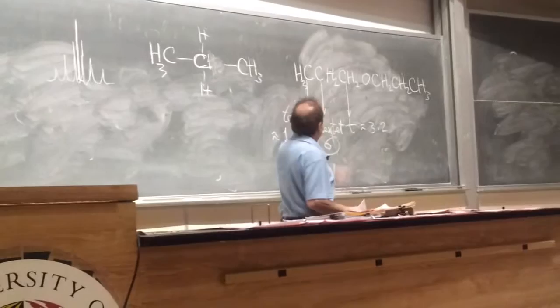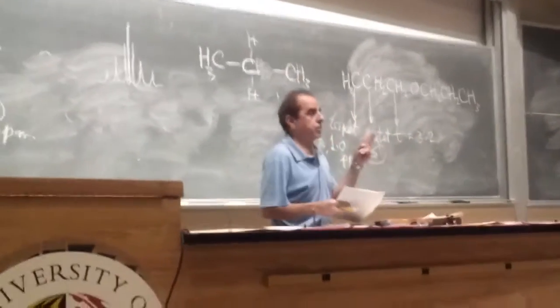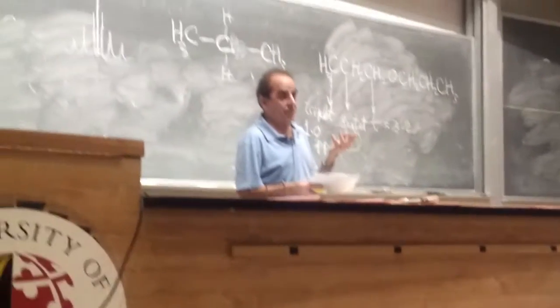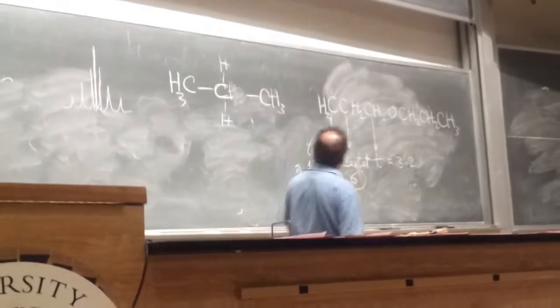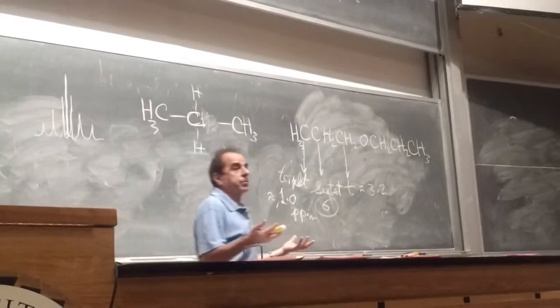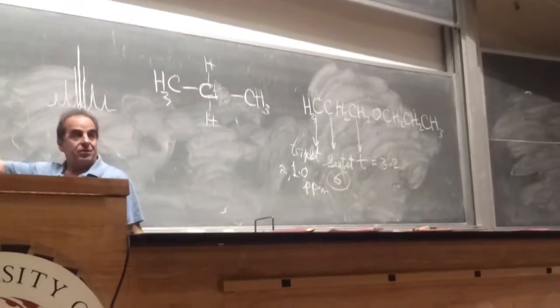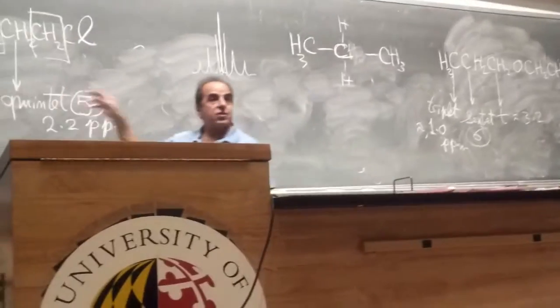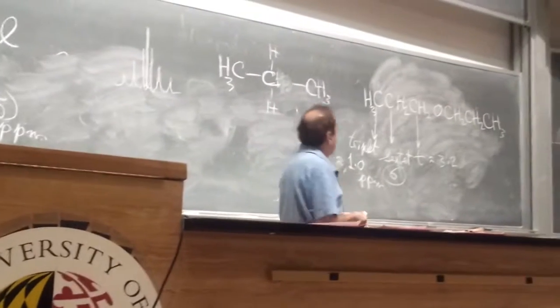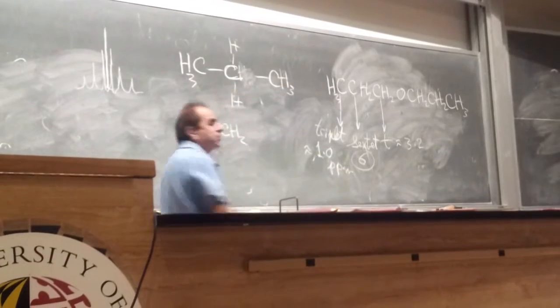Okay. So the first thing that you look at, we look at two things. We look at the chemical shifts. We also look at the multiplicity of the signals. When I have a triplet, a sextet, and a triplet, I must have a propyl group. But of course, you have to make sure you don't have this pattern, right? So for each group, you have to figure out what combinations you're going to have. For an ethyl group, for example, we said that you have, guys, there's a lot of talking.